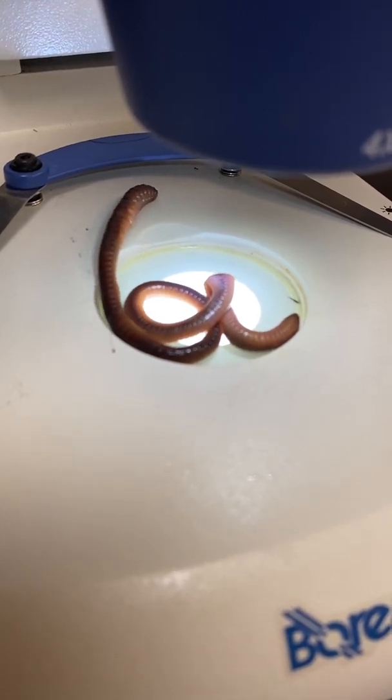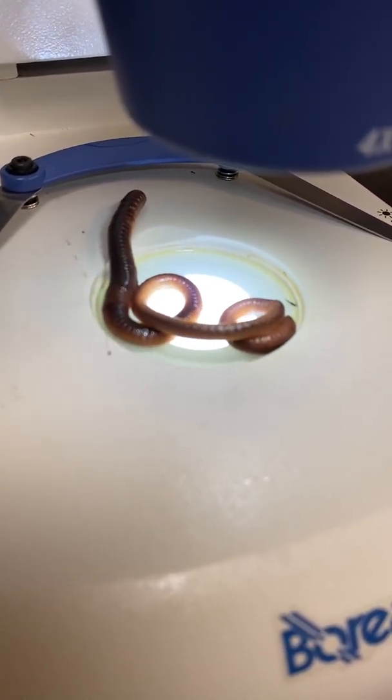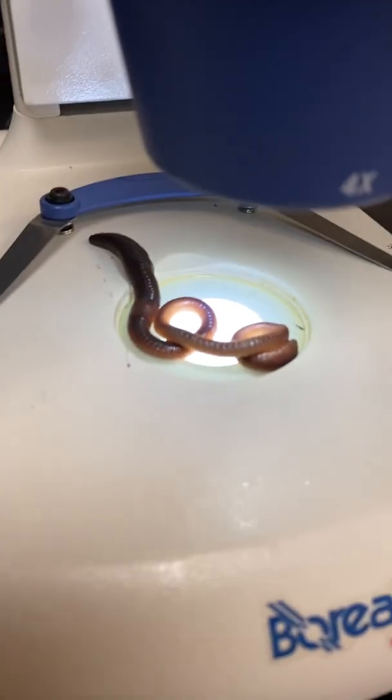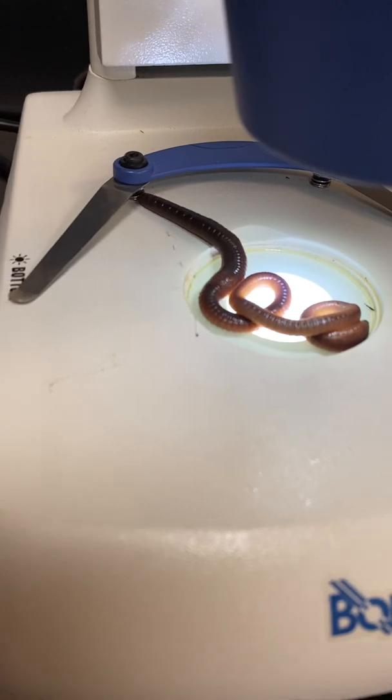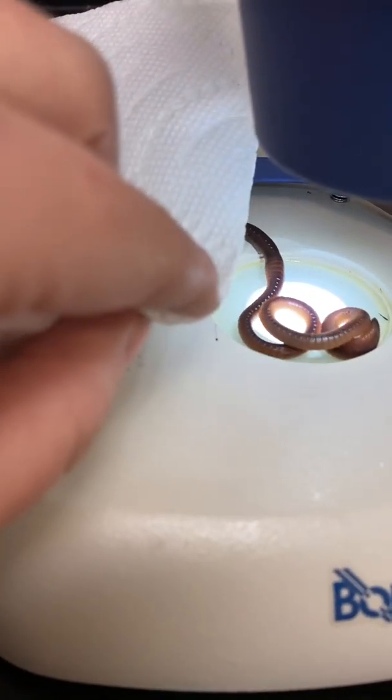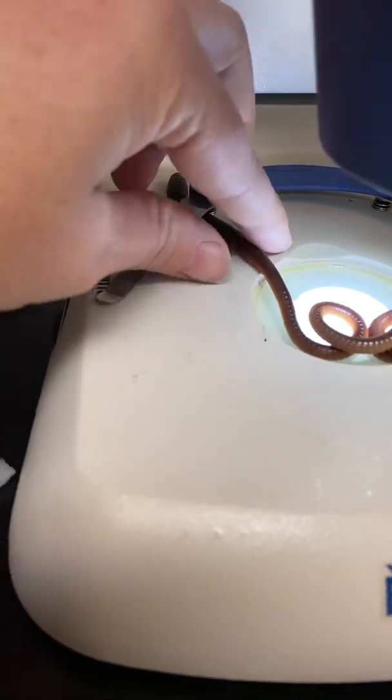Because the light will dry them out. Yeah, so just put that they move away from the light. And then for number 26, put down what type of taxis that is.